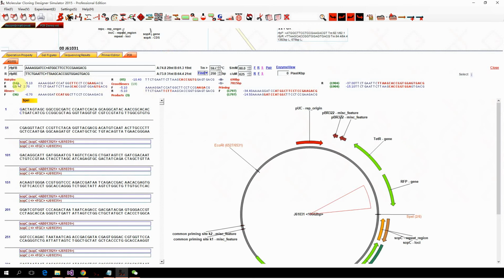and check this panel. So you can see the hairpin with the highest Gibbs energy change for the forward primer, reverse primer, and the dimer and the cross dimer for them. And can see possible product length 0, 1, and mismatching here. And see here, this is very important.